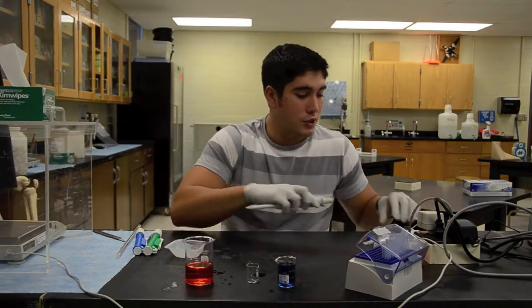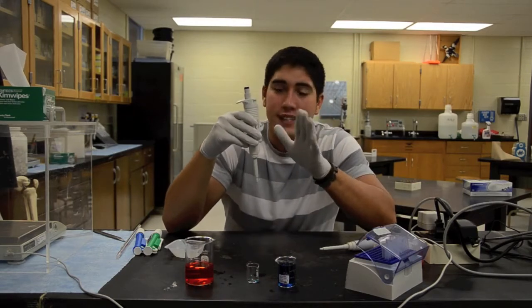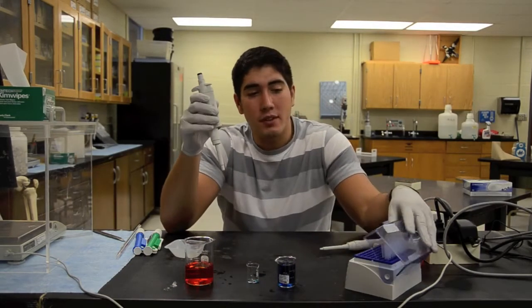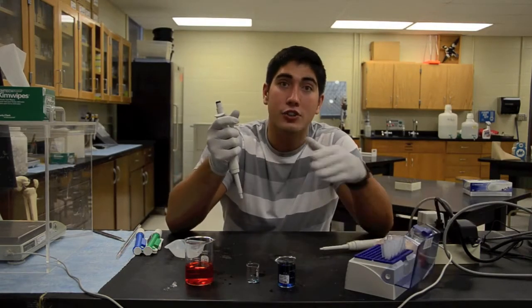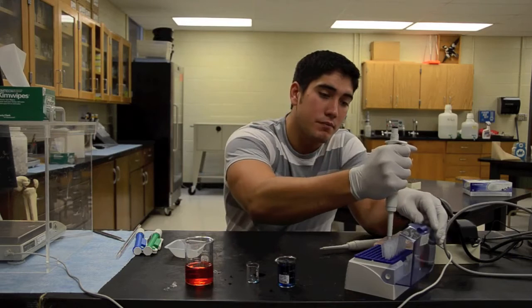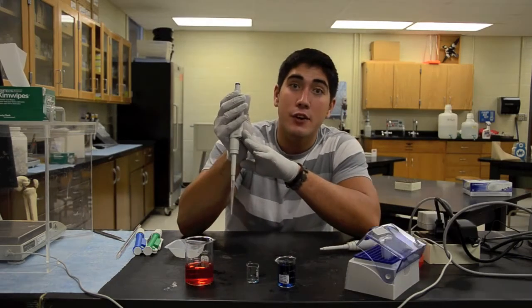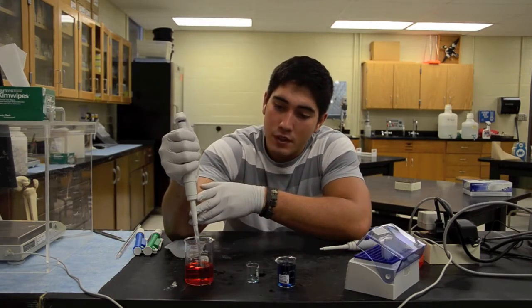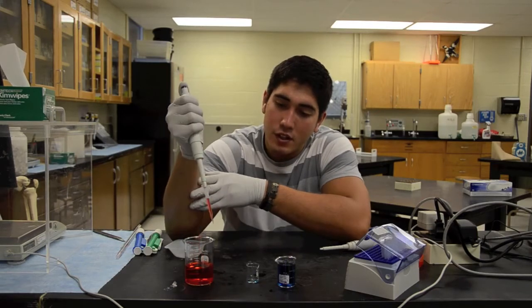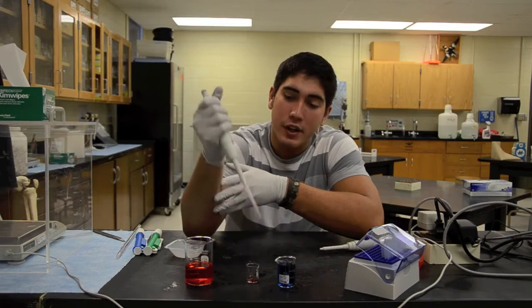Alright, now I'm going to show you how to use the 1,000 microliter pipette. It's used the exact same way as the first one, except the only difference is you're going to be using a larger pipette tip, of course, to hold the larger amount of liquid. So we're going to go in here, push in like so, and right here it's set at 750 microliters. So we go down to the first stop, extract 750 microliters, and second stop to eject it into our beaker.